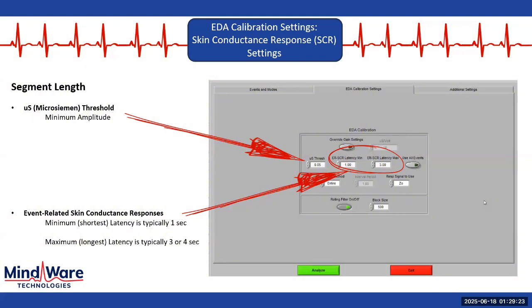This is pretty ubiquitous in the sense that this 0.05 is used in most research studies. Some will use different thresholds such as 0.03 or all the way up to 0.07. I think in a lot of cases it's more important to just find consistency throughout your study and ensure that we're referencing a very high impact factor journal on which we can reference as to why we're using that threshold. But as far as our recommendation, 0.05 would be that.